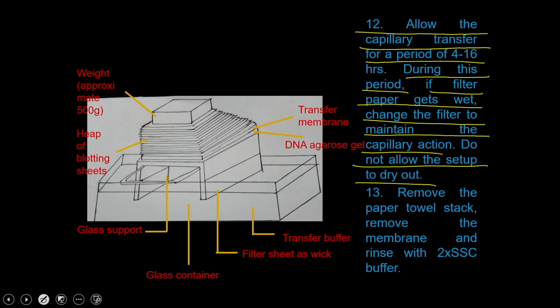Then once the transfer is over, you can remove the paper towel stack, remove the membrane and rinse it with 2x SSC buffer. So, once the transfer is over, you can remove all the paper towels, take out the membrane, and wash it with the 2x SSC buffer.